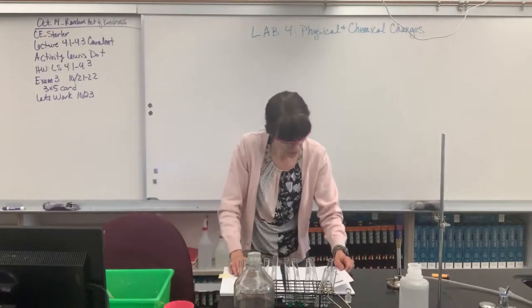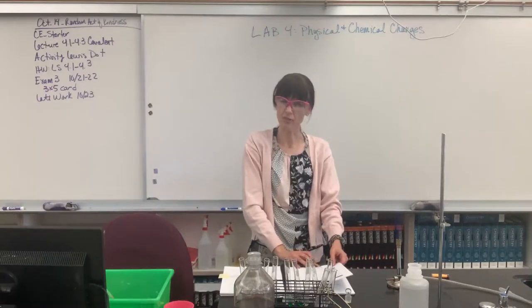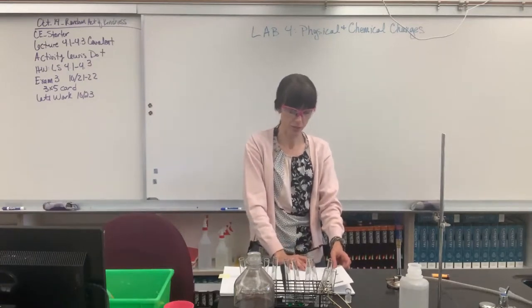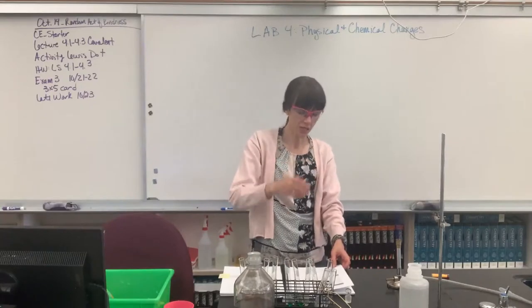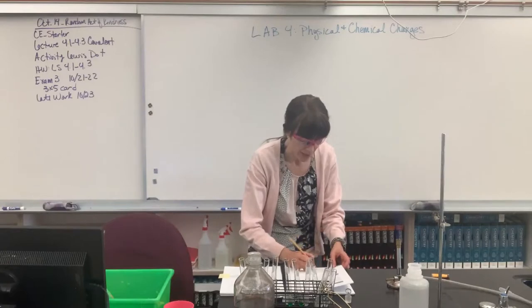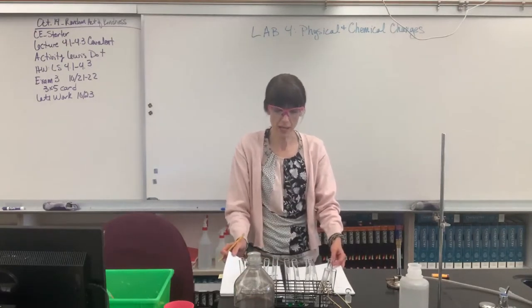If you'll go to page 54 for me, please. Where it says before combustion evolved gas, would you please also write clear liquid? And now after combustion, appearance of the sample is a white ash. White ash. And then we added the HCl to it. It also evolved gas, but it has a cloudy liquid. Cloudy liquid. Okay, good. And there is our lab.